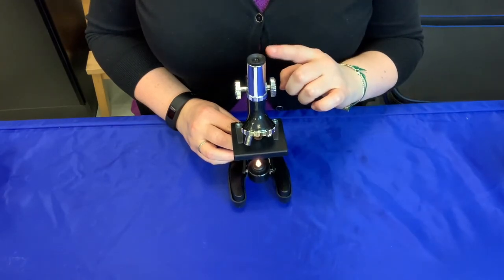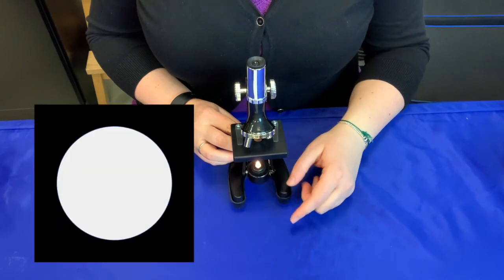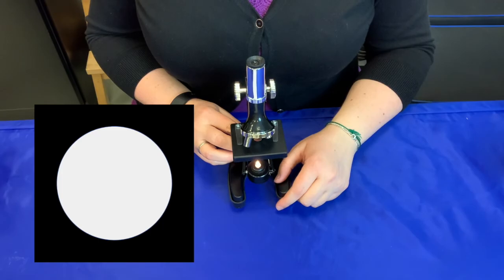Now when you look through the eyepiece, you're going to adjust the angle of the light bulb until you see a bright circle. When you see the bright circle of light in the eyepiece, you're ready to go.